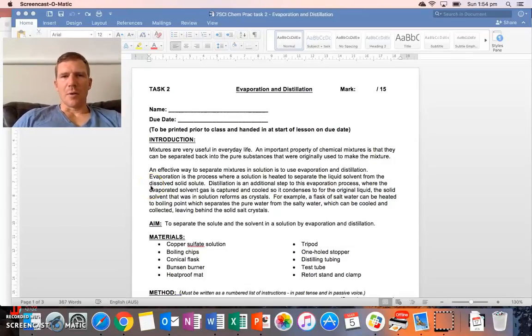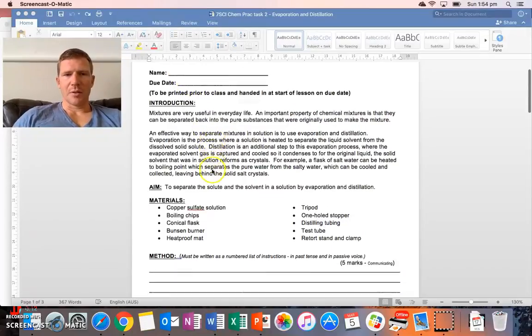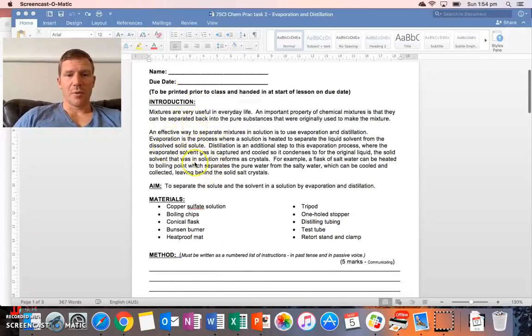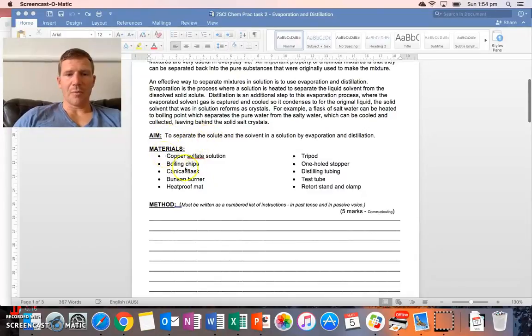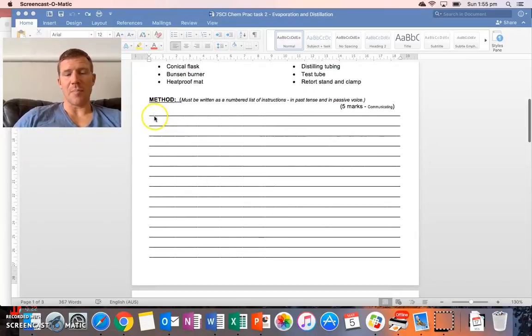Hi guys, it's Mr. Holding, and this quick video is having a look at your evaporation and distillation prac and how to write our method. Okay, so this is our prac here, and you would have gone through, put your name, due date, and read through the introduction, the aim and the materials, so you know the purpose of this and what equipment you're going to use. And now the first thing it asks is to write our method.